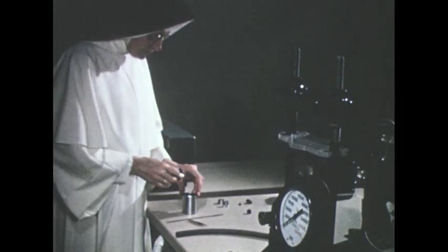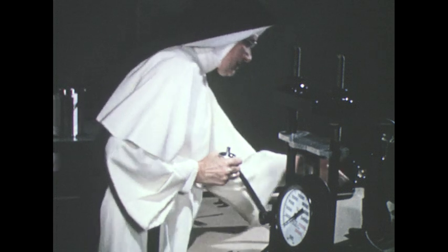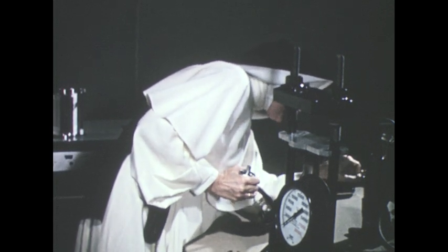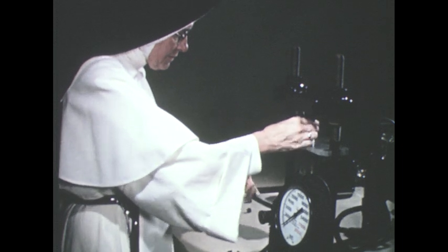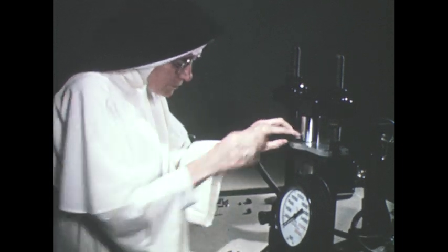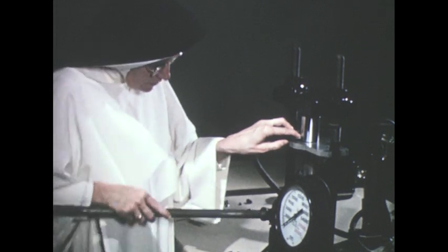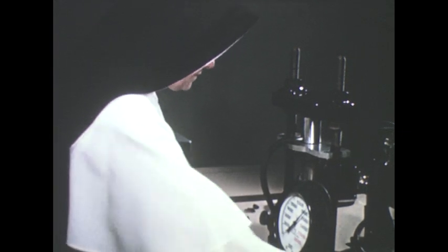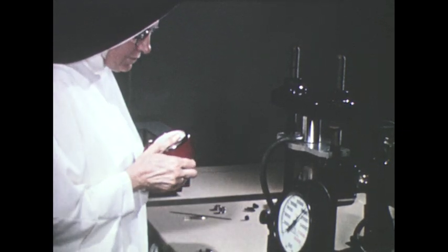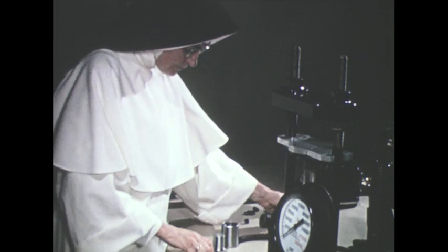The die is completely assembled and evacuated. Pressure is applied in a hydraulic press for about 5 minutes while the die is under vacuum. The die is then disassembled and the sample removed.